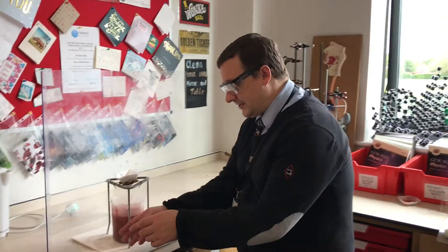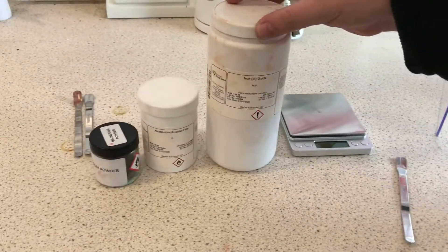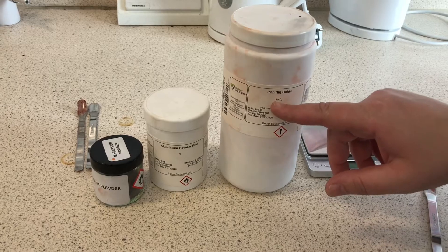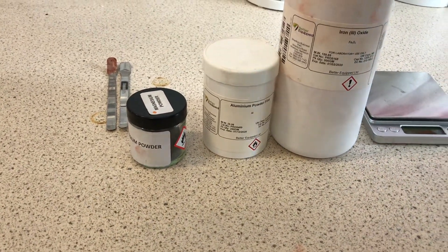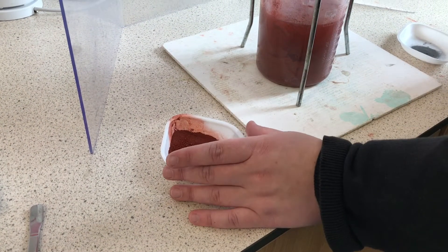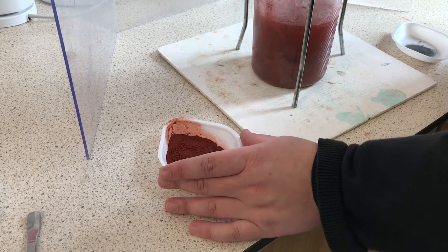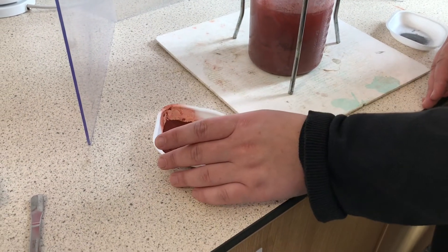Hello and welcome to In the Lab. Today we've got what will hopefully be a spectacular experiment called thermite. This is the thermite mixture. We have iron oxide — specifically iron three oxide — and aluminium powder. These two are mixed together very carefully just before the experiment, because if you store them mixed there is a risk that the mixture will actually explode on its own.